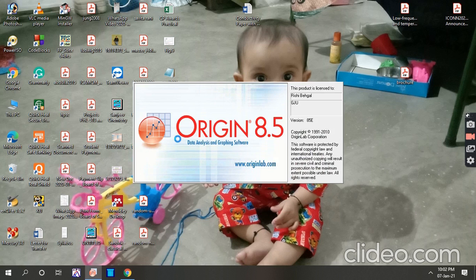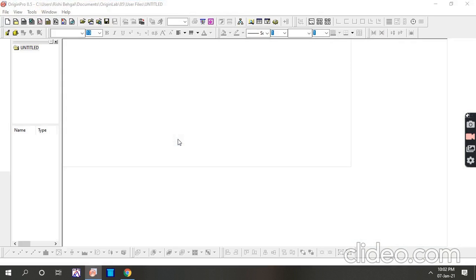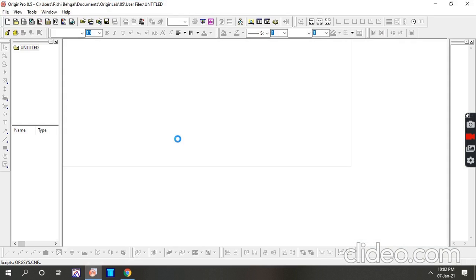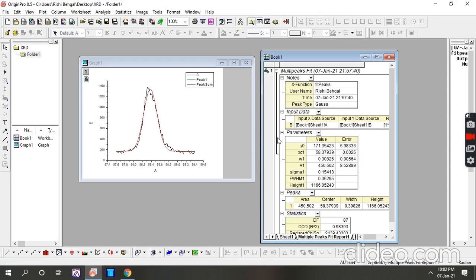Regarding Gaussian fitting — in Origin this is totally 100% Gaussian fitting. But in XPS software, it will be a sum of two peak types, like 50% Lorentzian and 50% Gaussian. But in Origin, this is only Gaussian fitting.